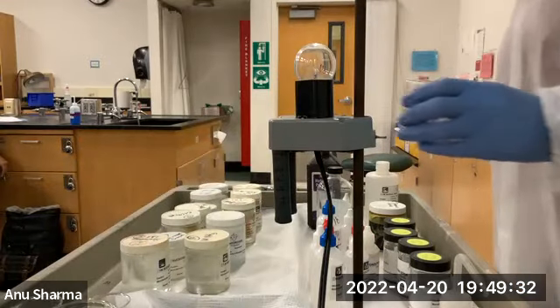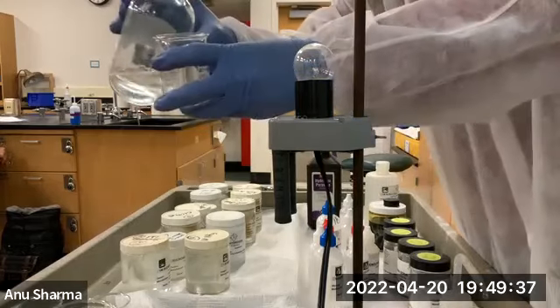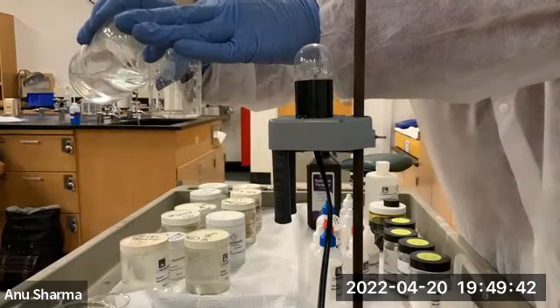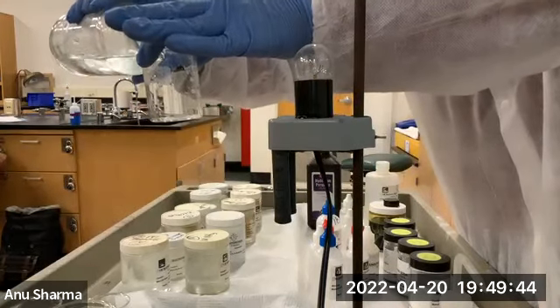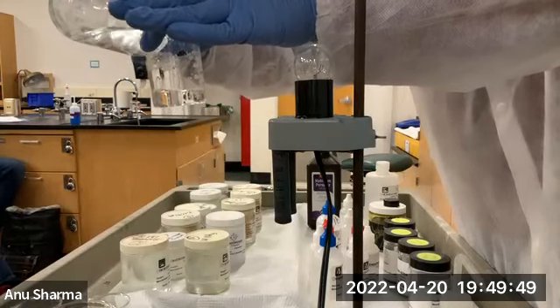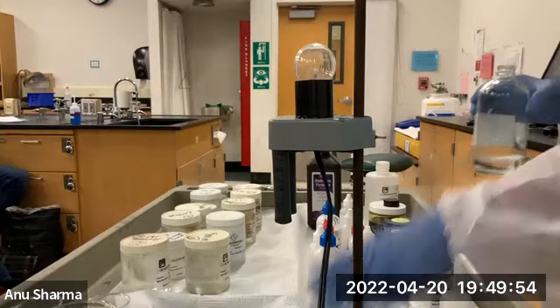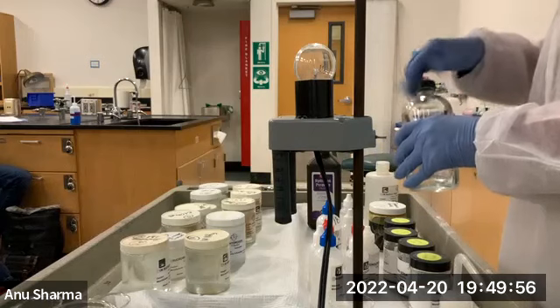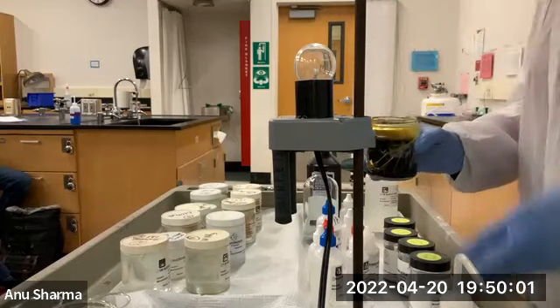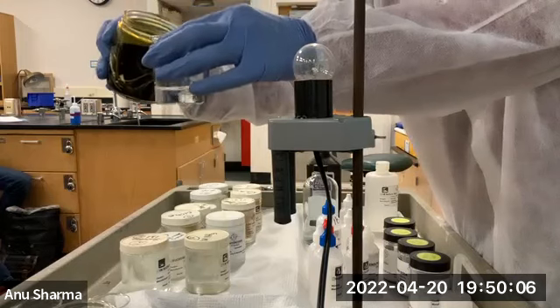Okay. Here, I'm adding some deionized water in the beaker. So we have about 20 ml of water. Bring the tincture of iodine and mix it in water.